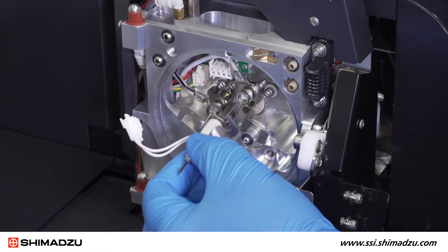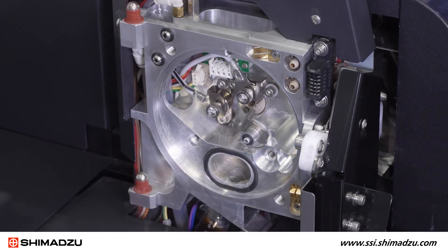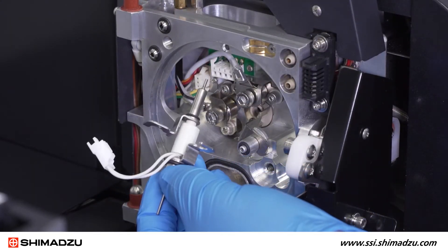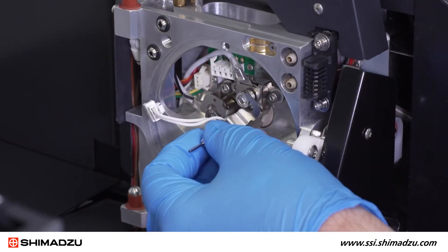Rotate the DL assembly clockwise and remove it from the mass spectrometer. Insert a new DL assembly in the direction shown. Note that the special design of the orifice maintains vacuum during this procedure.